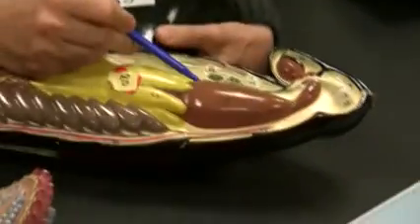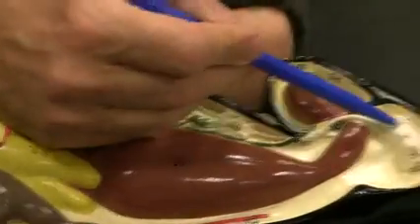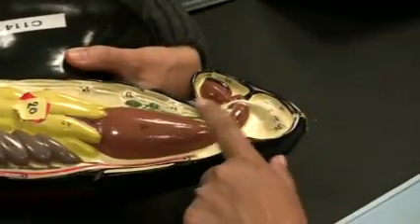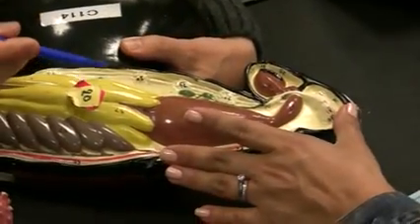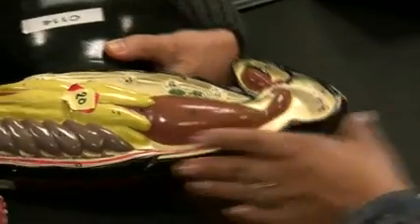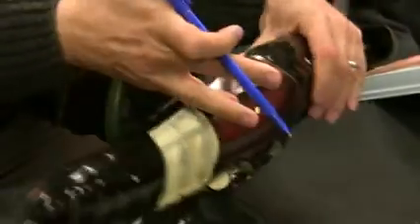Oh, can you show the digestive glands again? Sorry about that. These are digestive glands. And the brain? The brain right here. Over there. Okay. And Amir, the crop and the gizzard are in what section of the grasshopper? This is the thorax. Up from here to here is the thorax.